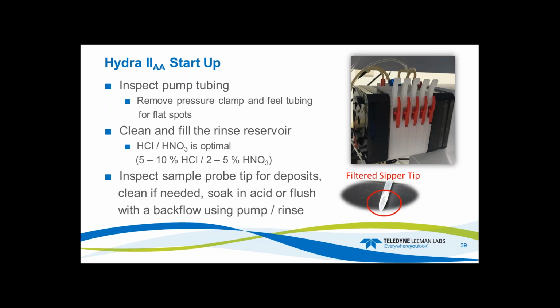You want to clean and fill the rinse reservoir. HCl, nitric acid, is optimal. 5 to 10% HCl, maybe a 2 to 5% nitric. You'll just have to decide what works best for your method.